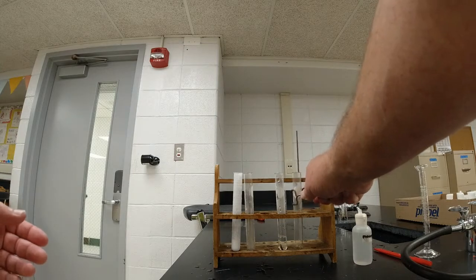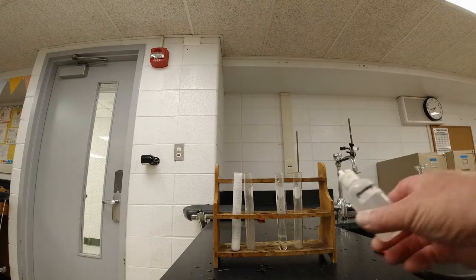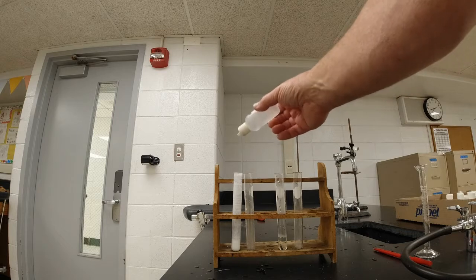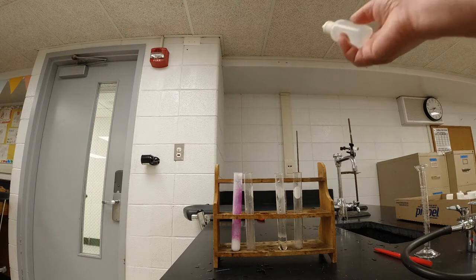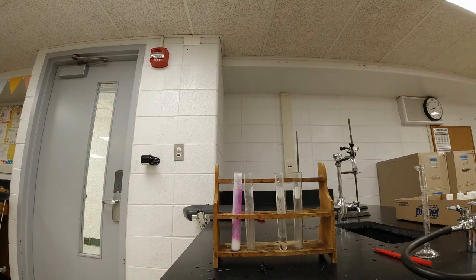All right. Now, another way to tell, besides just listening for that popping sound that goes on, you can use an indicator. Phenolphthalein is an indicator of acid base. And so if I put a drop in here, it's going to change color. I put in one drop, and you can immediately see lots of pink color. I'm going to add one drop to the magnesium, and maybe it doesn't even look like anything happened at all here.